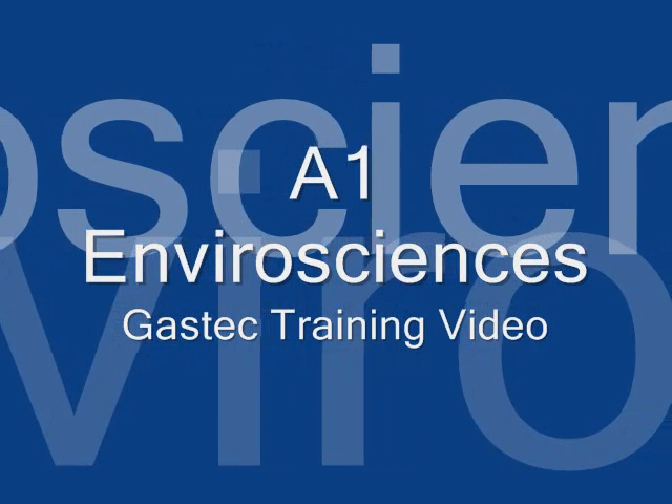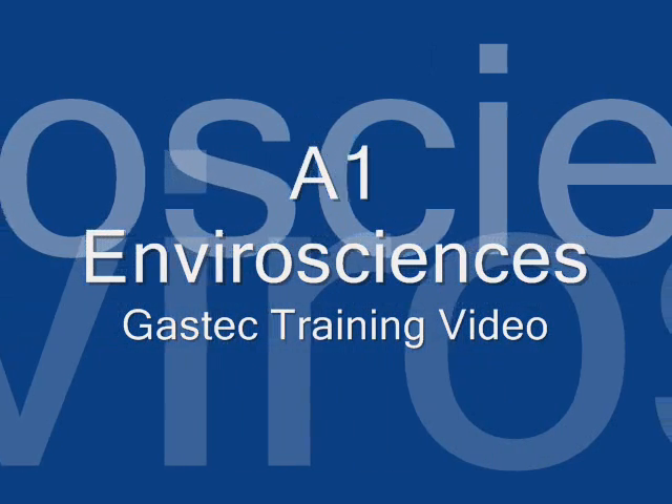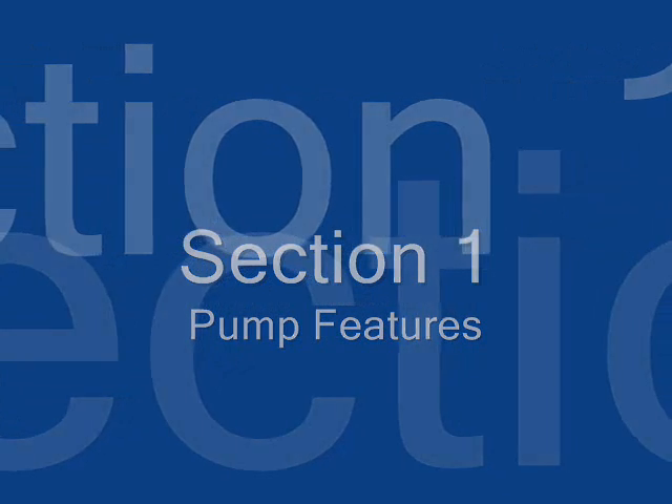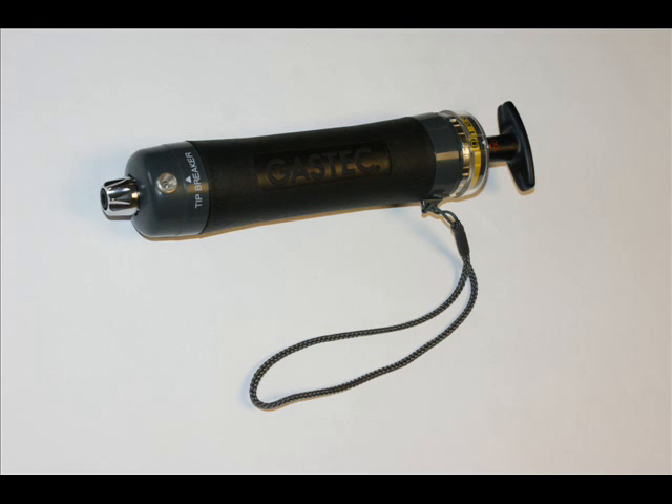Hello and welcome to the A1 EnviroSciences GasTech training video. Section 1: Pump Features. The GasTech pump has been designed to be robust, compact and easy to use.